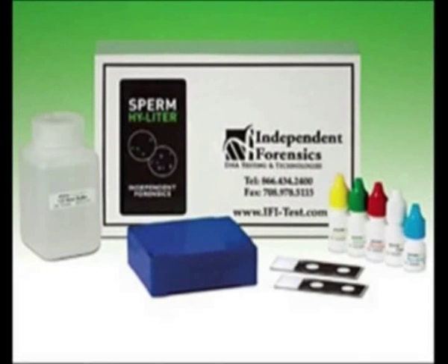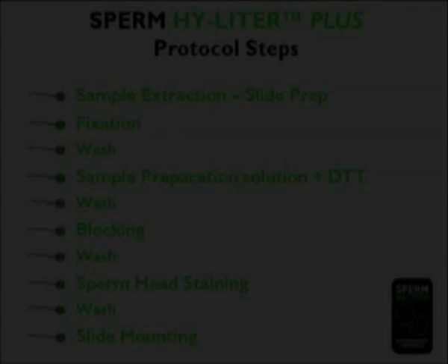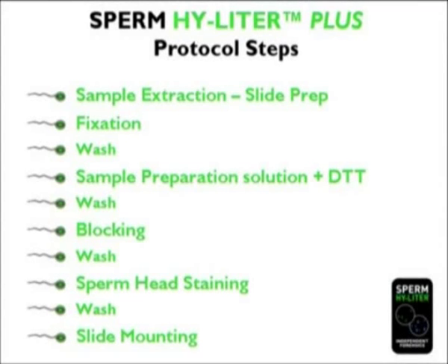The new Sperm Highlighter Kit sensitively and specifically labels human sperm heads with a fluorescently tagged antibody. The kit is easy to use and the simple and direct labeling procedure will be presented in this video. We will demonstrate the steps needed to extract biological material from a swab, apply the extract to a slide, and fluorescently label human sperm heads with the Sperm Highlighter Kit.